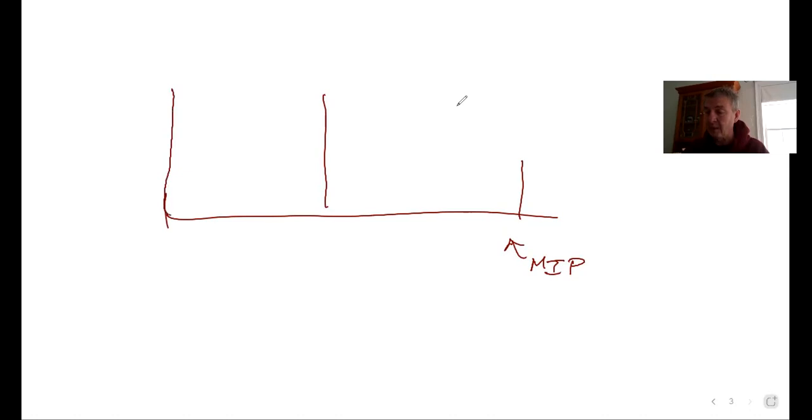Now, if we're going to do this, we said that the x-axis is the mass. We should talk about, oh, by the way, the tallest peak is called the base peak. So molecular ion peak, base peak. Very often, if you have a low enough energetic electron gun, you can only get the molecular ion peak, so it's also your base peak.